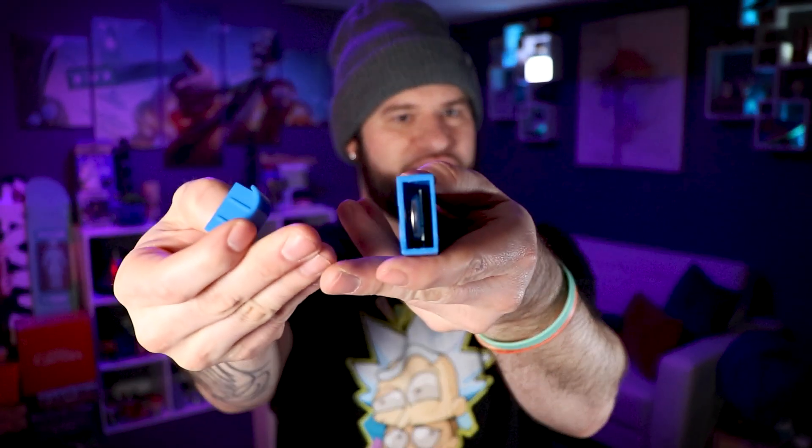Something I love about it: apparently it runs off AAA batteries. Way better than these cheap meters that run off those little watch batteries. I already have a ton of AAAs, so this is perfect.